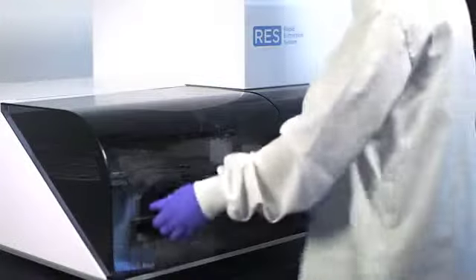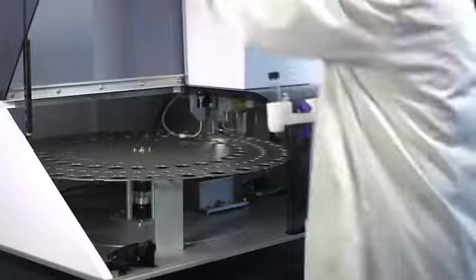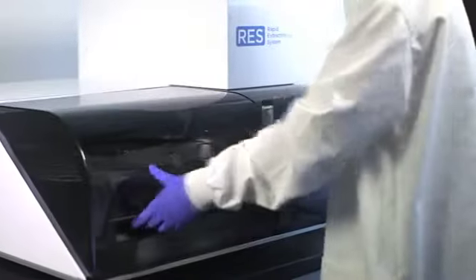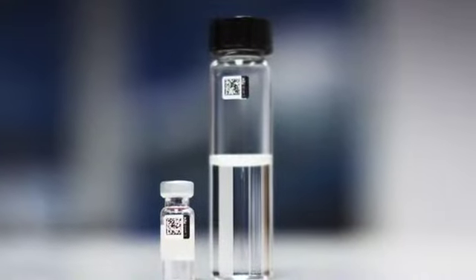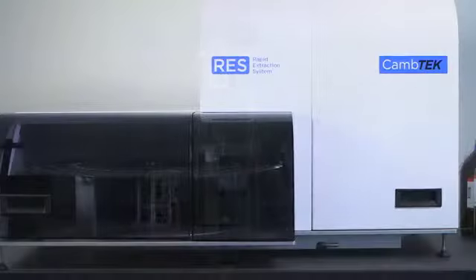The samples are automatically processed, and the prepared samples are either delivered to an HPLC vial, or injected via a transfer line directly into your HPLC. It really is that simple.